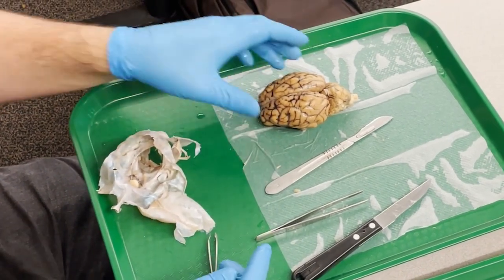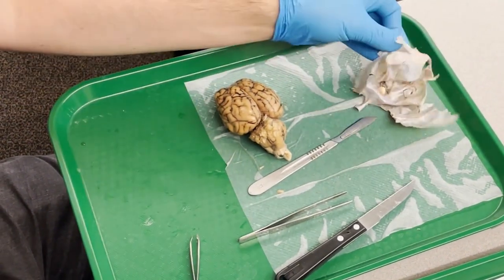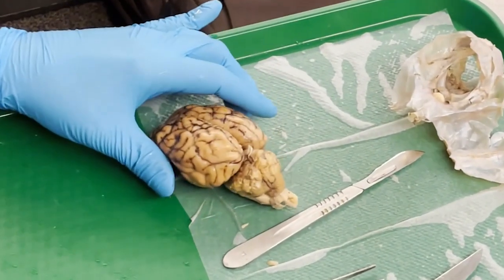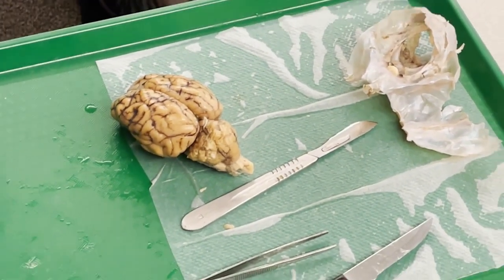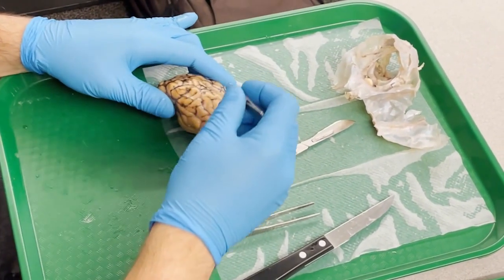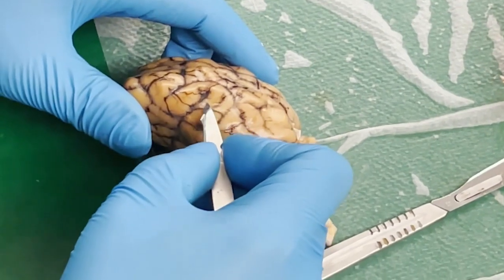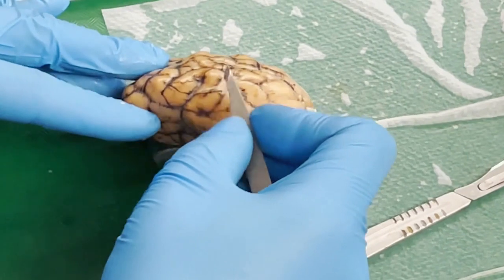Okay, so that's the dura mater and probably the arachnoid membrane taken off. I mentioned the pia mater. That's gonna be even trickier. But one of the tricks to this is that the blood vessels, they're not just stuck onto the brain. They are held onto the brain with the pia mater, which is a very translucent thin membrane. So if you find a blood vessel and you just kind of get underneath it and lift it up, you'll kind of see that there is this very, very thin membrane that goes all throughout the brain.